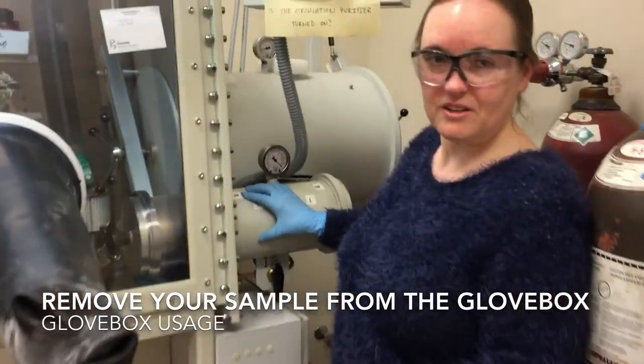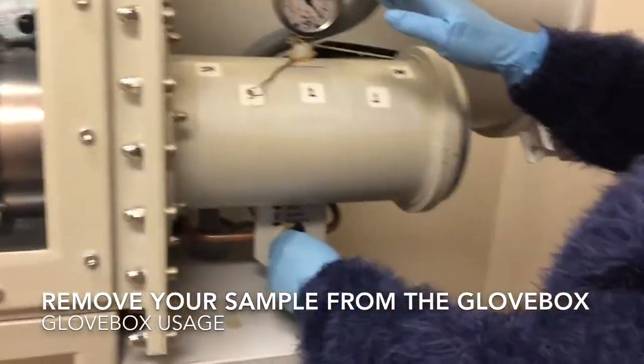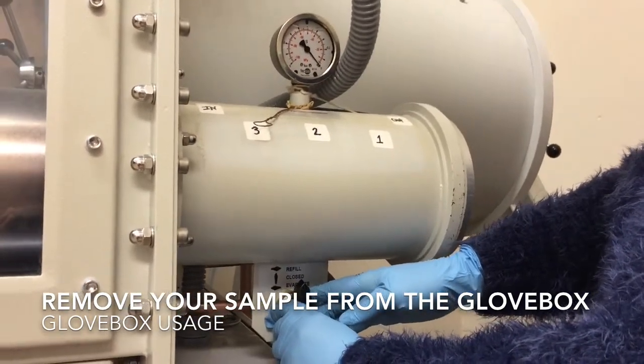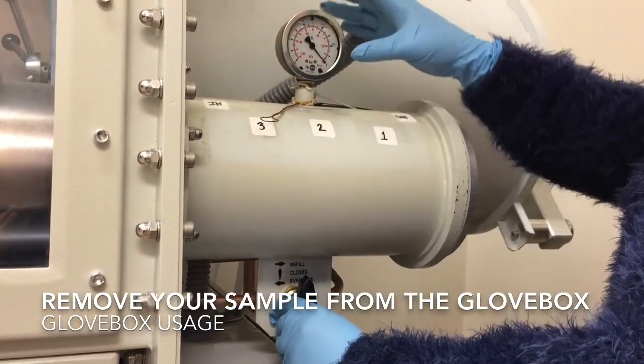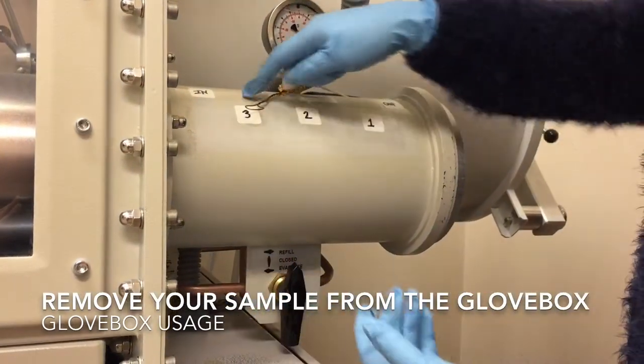I've already placed my sample back into the anti-chamber, and I've closed the valve so that I won't be using excess nitrogen when I'm ready to take it out. The gauge says zero, so I'm ready to take it out of the box.